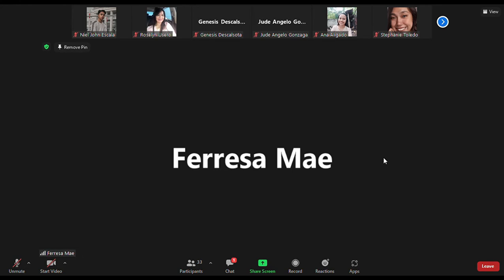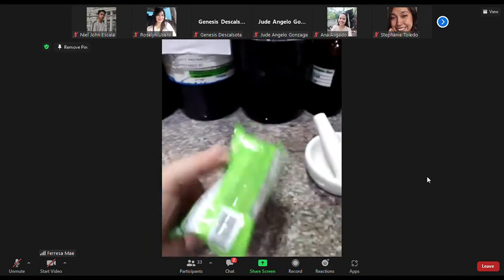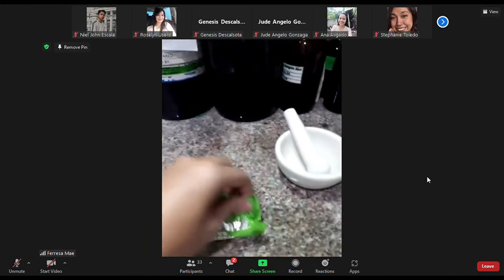So while waiting sa moisture analyzer, prepare ta na isa ka sample. Next nga kuan moisture.